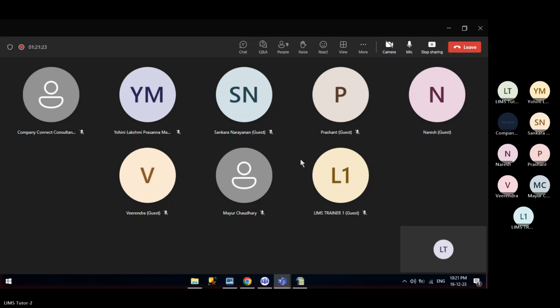But an auditor will not check each application to track investigations. They need a separate dedicated application to track all the investigations, incidents, and OOS OOTs. All these years I have been hearing this reason from the QA side. They always need a QMS system where they can centrally track incidents from every area of manufacturing as well as quality.